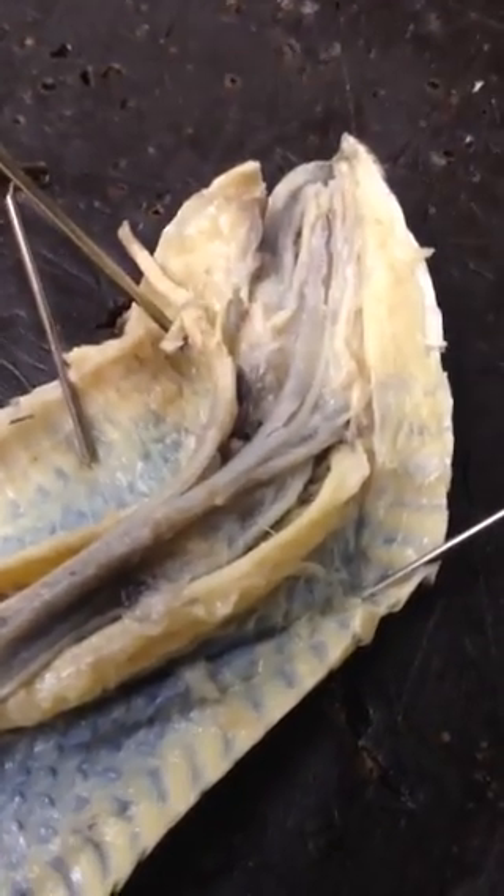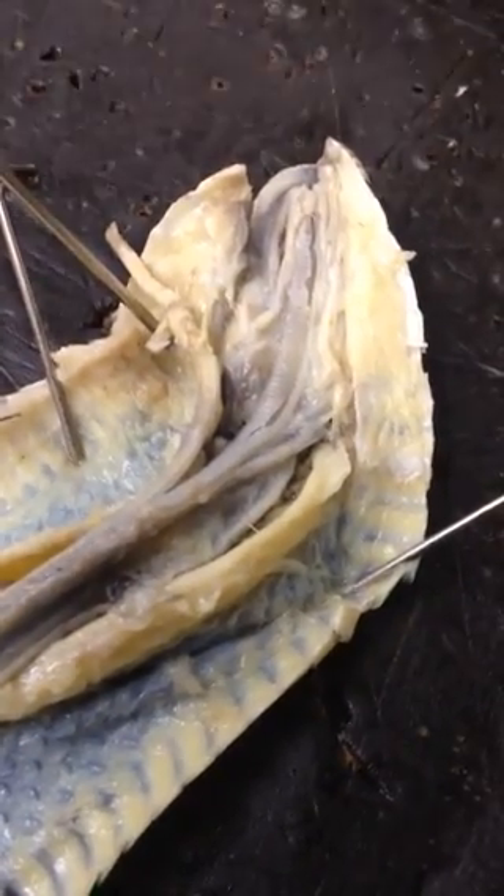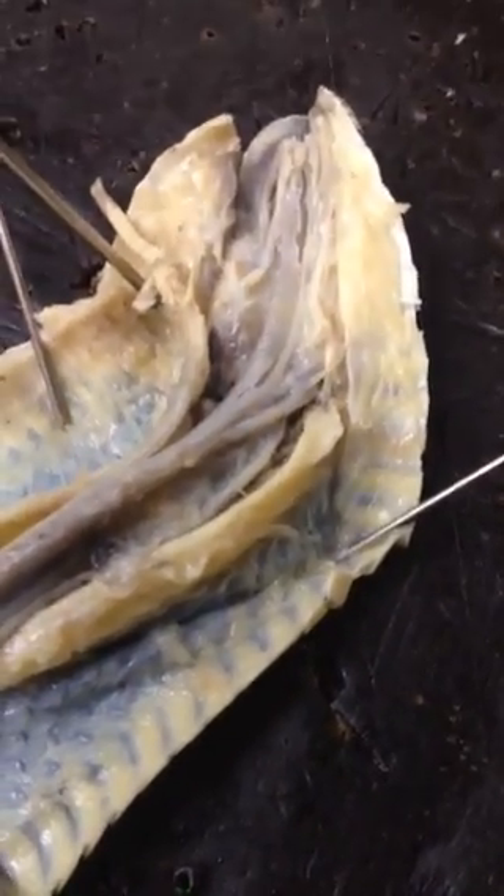Here we have a snake. We are in the phylum Chordata, the subphylum Craniata, the class Reptilia, and the order Squamata.